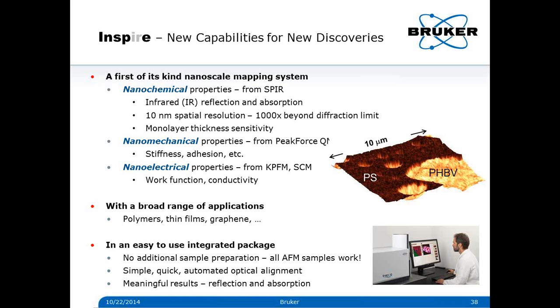We have a question on the sensitivity. What is the minimum thickness, and what's the sensitivity to thickness differences or to film thickness of the technique? That's a good question. So we have shown part of it already. If you look at graphene, which is only, I think, 0.3 nanometer thin, it's quite tiny, and you can distinguish that, and you can count the layers in graphene with this technique. So we have really sub-nanometer sensitivity in the thickness of a material.